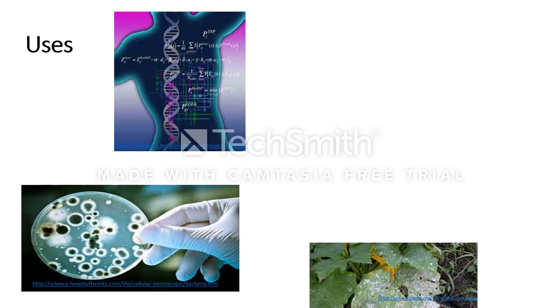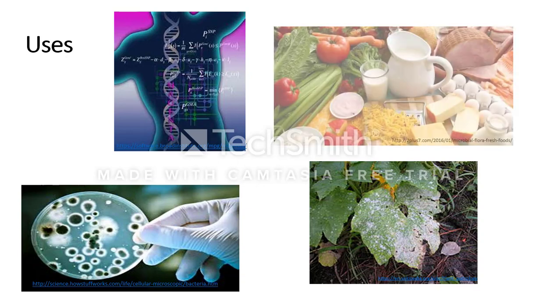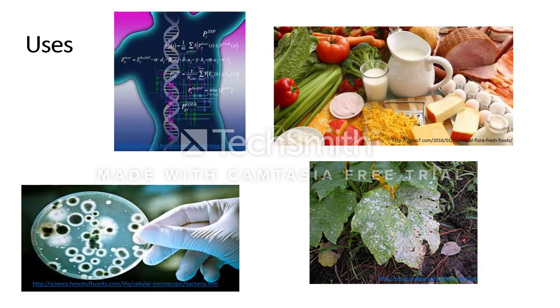Recently, qPCR has also found uses in detecting plant pathogens. Molecular methods are increasingly being used to detect, quantify, and study microbial populations in food or during food processes. Among these methods, PCR-based techniques have been the subject of considerable focus, and ISO guidelines have been established for the detection of foodborne pathogens. qPCR is considered a method of choice for the detection and quantification of microorganisms. One of its major advantages is that it is faster than conventional culture-based methods. It is also highly sensitive and enables simultaneous detection of different microorganisms.